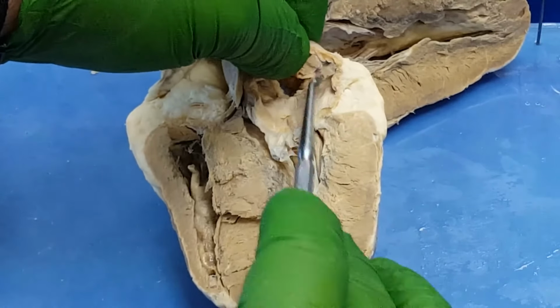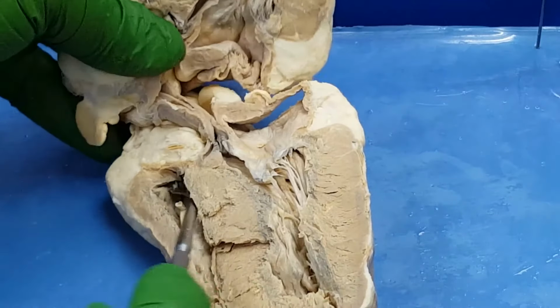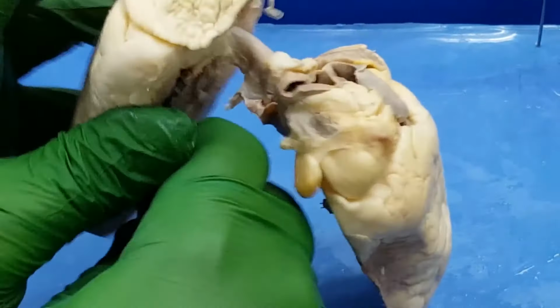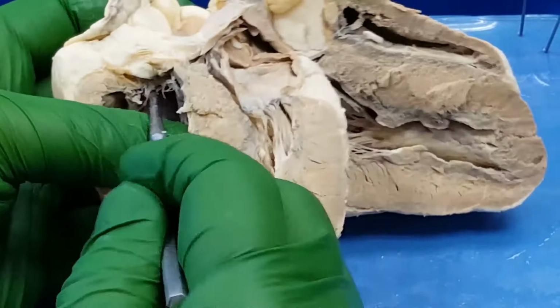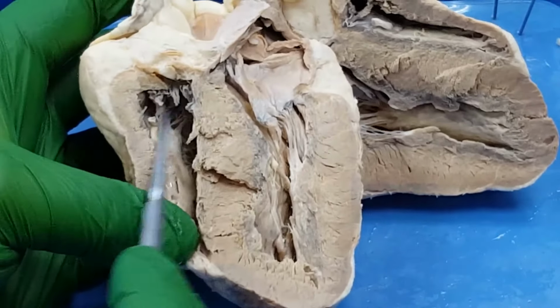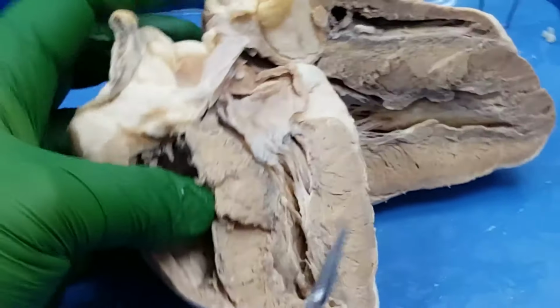Ventricle, atrium. The right atrium is always a little tougher because of dissection. So I see those cords, and I stick my probe up above this chamber that I'm waggling around in right here, above the tricuspid valve, is the right atrium.